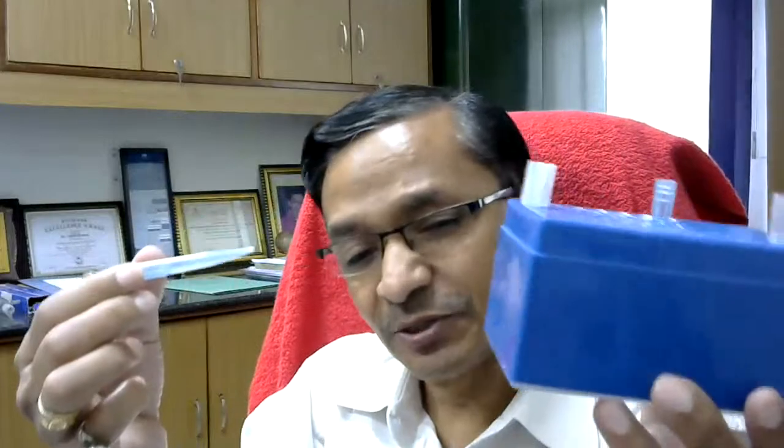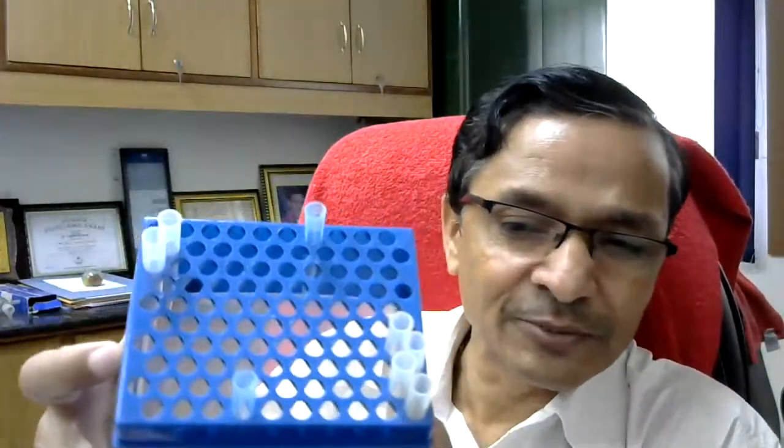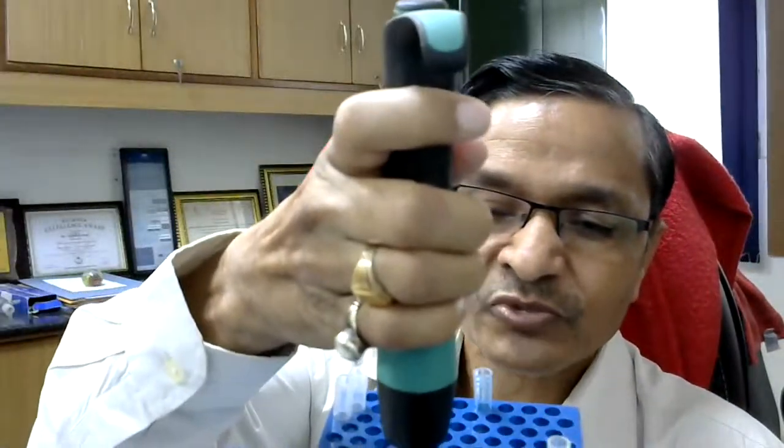So these are the tips which can be used for 1 ml. If you are using a 1 ml pipette, then blue tips and a blue tip box. This is the tip box, so you can arrange tips here in all these holes. Of course this is a 5 ml pipette, but I will try to show you like that.